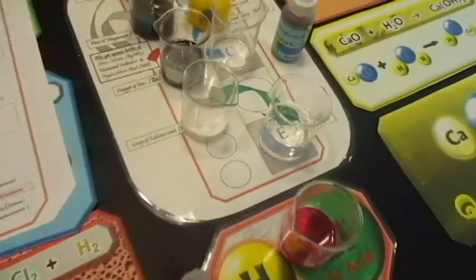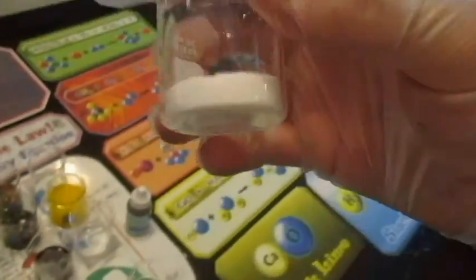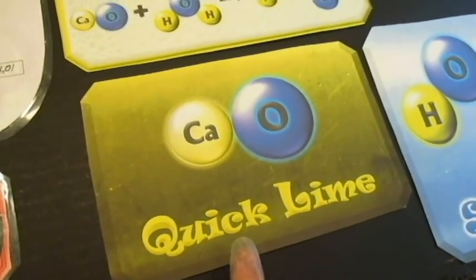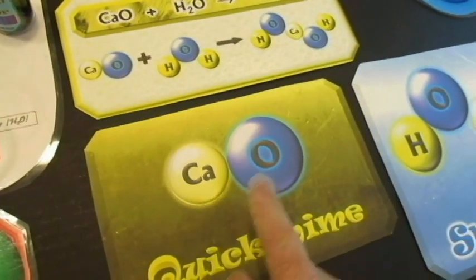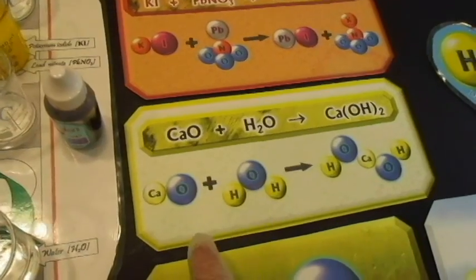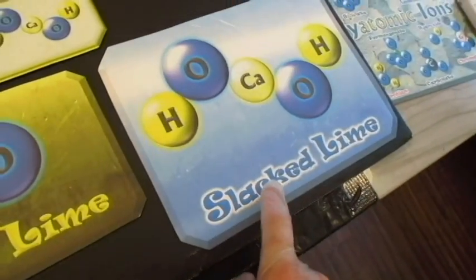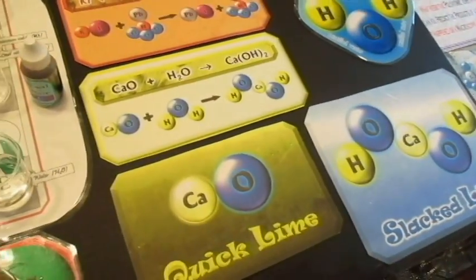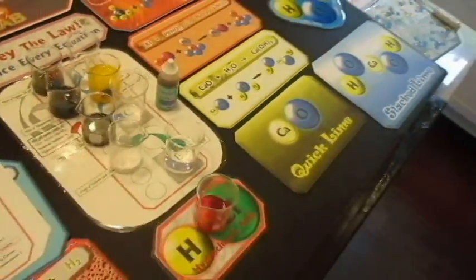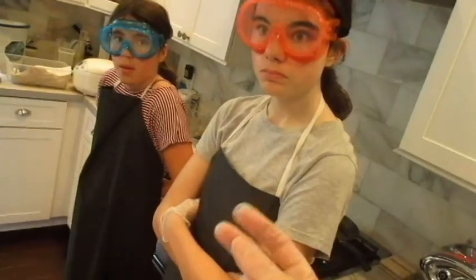So calcium oxide is this white powder. See that white powder? It is known as quicklime. That's one of the ways that we find calcium. If it's been lying around, it oxidizes. But after this reaction happens, what we wind up with is called slaked lime. These are chemicals that we sometimes use in cement. Sometimes going from this to this is one of the reasons that cement works. Did you know that? Like sidewalks that you walk on?